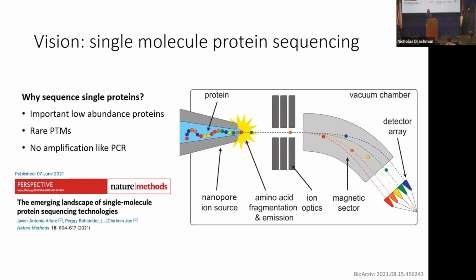Thank you, Nicholas. That's certainly exciting. I think there certainly have been claims of electrospray being much more efficient than 1%. Certainly Dick Smith would like to say they can make it 50% efficient. And people have also used very small tips with chromatography, which improves ionization, but makes the process more painful. So I think what you're showing is really exciting, as you can tell from the questions.